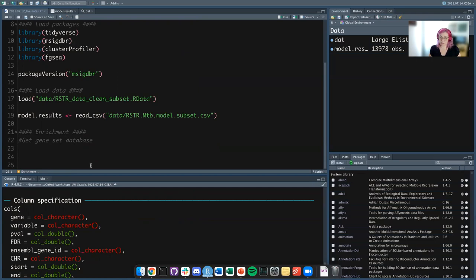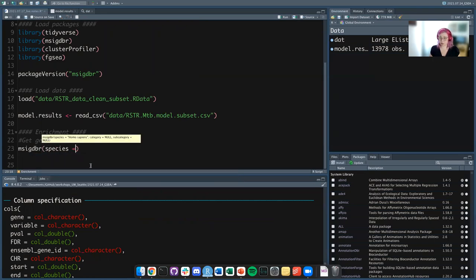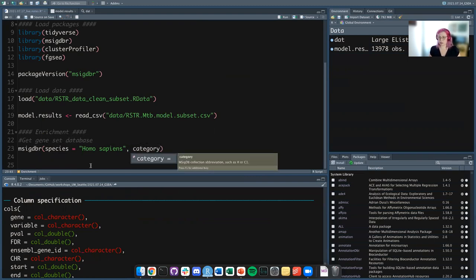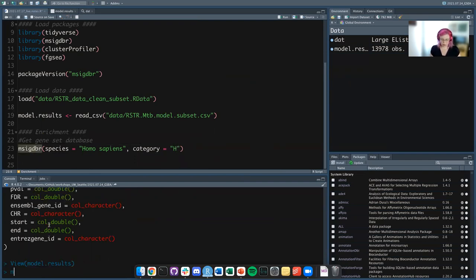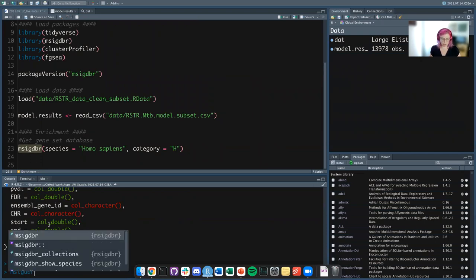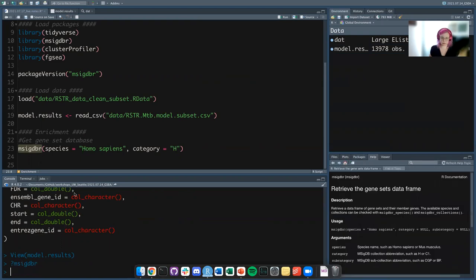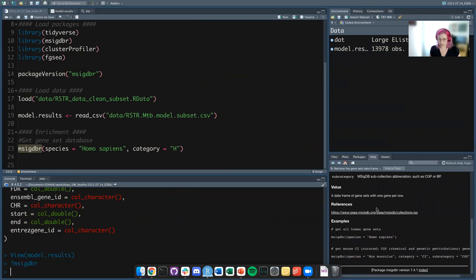The msigdbr package has the function with the exact same name: msigdbr(). You tell it what your species is — this has more than just human, we want 'Homo sapiens' — and then you tell it your category. Is it Hallmark? Is it C2? The help page has a link to the Broad page which will tell you the category codes. Hallmark is just category 'H'. Without saving the result, we see it has columns for category, subcategory — Hallmark doesn't have any subcategories — and then all of our terms prefaced with 'HALLMARK_', the gene symbol, the Entrez ID, the Ensembl ID, and actually every possible ID.